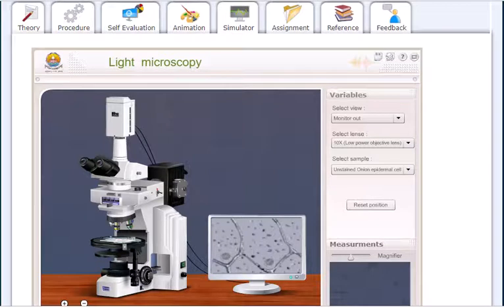the bacteria, what we need to do is, once the bacteria are ready on the slide, even if you have not cultured but you have the permanent slides of the bacteria, both gram negative and gram positive, then still you can observe under the microscope. So using a virtual lab we can understand how the bacteria would look in the culture medium. All right, this is what I'm going to show you.